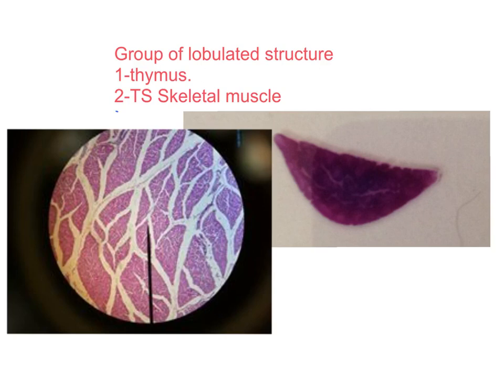Don't forget the word TS, because I have an LS skeletal muscle, which was an elongated structure. So in this slide you have to specify whether it is a longitudinal section or a transverse section, as this identification will take half of the mark.